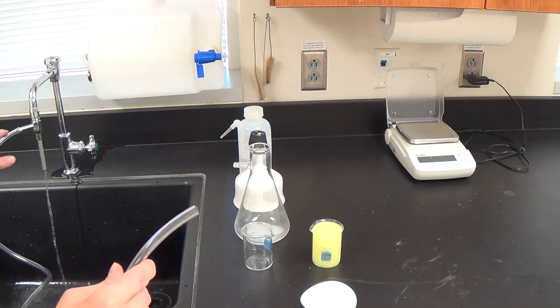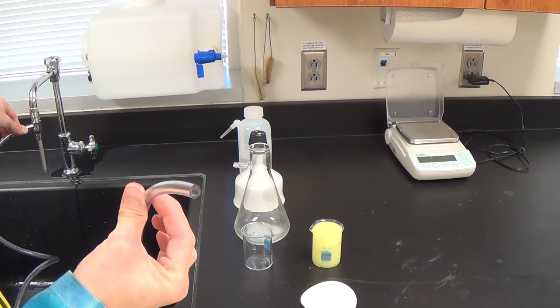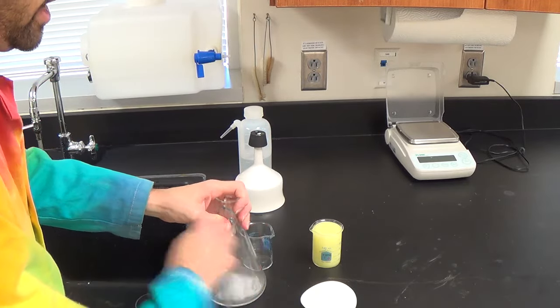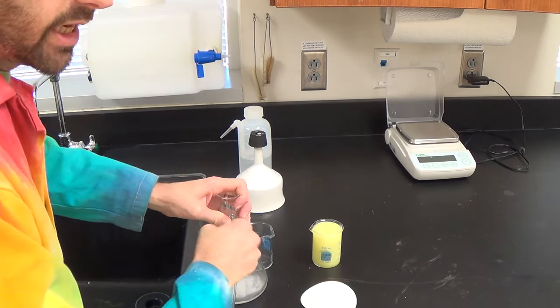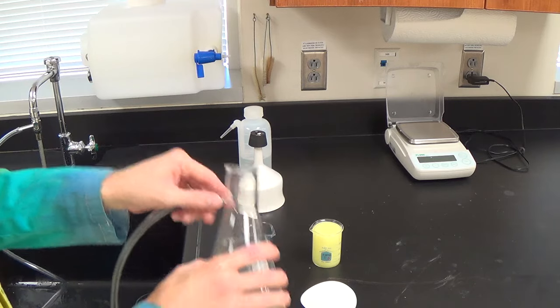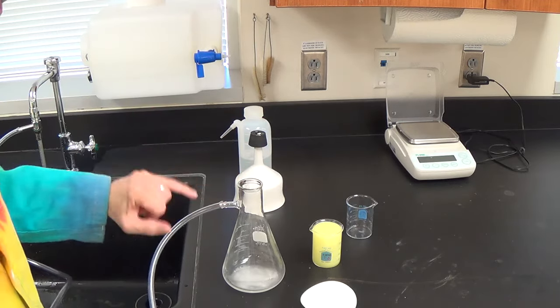All right, but for right now, you've got the hose, which is a thick tubing so that it can withstand the pressure, and you're going to put it on a flask that has a spout on it as well. And if you find it difficult to get this on, you could certainly wet the inside just a little bit, and it doesn't have to go all the way up through. All right, it just has to be on. If it popped off, you could put it back on again later. All right, so this is on our flask.